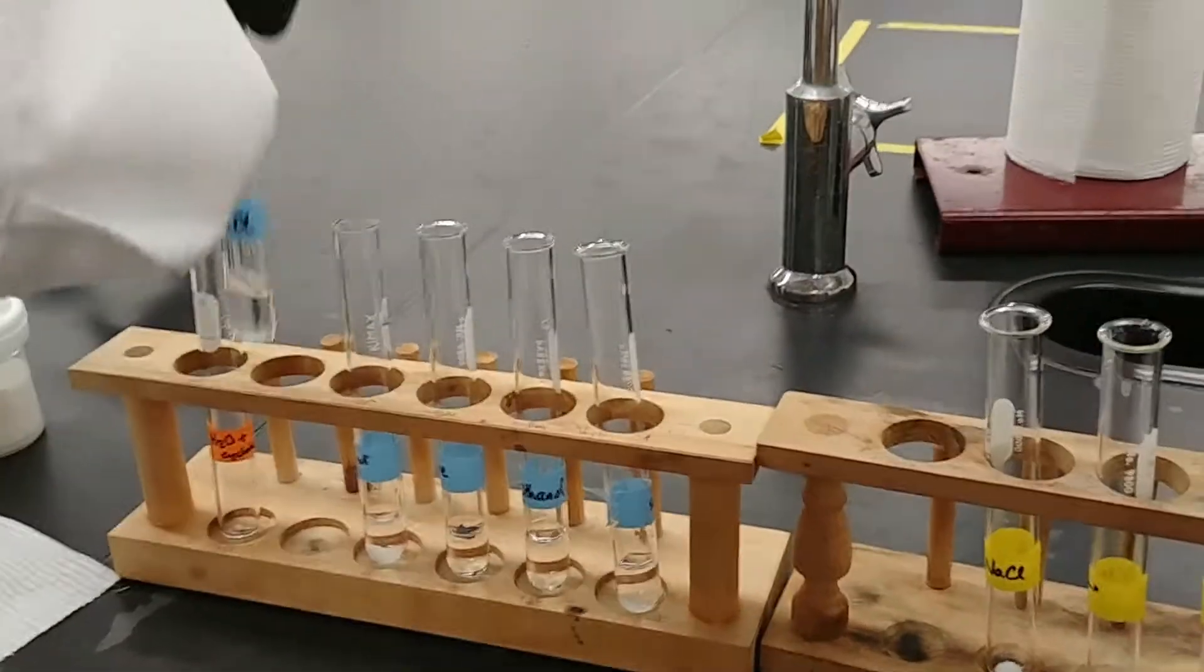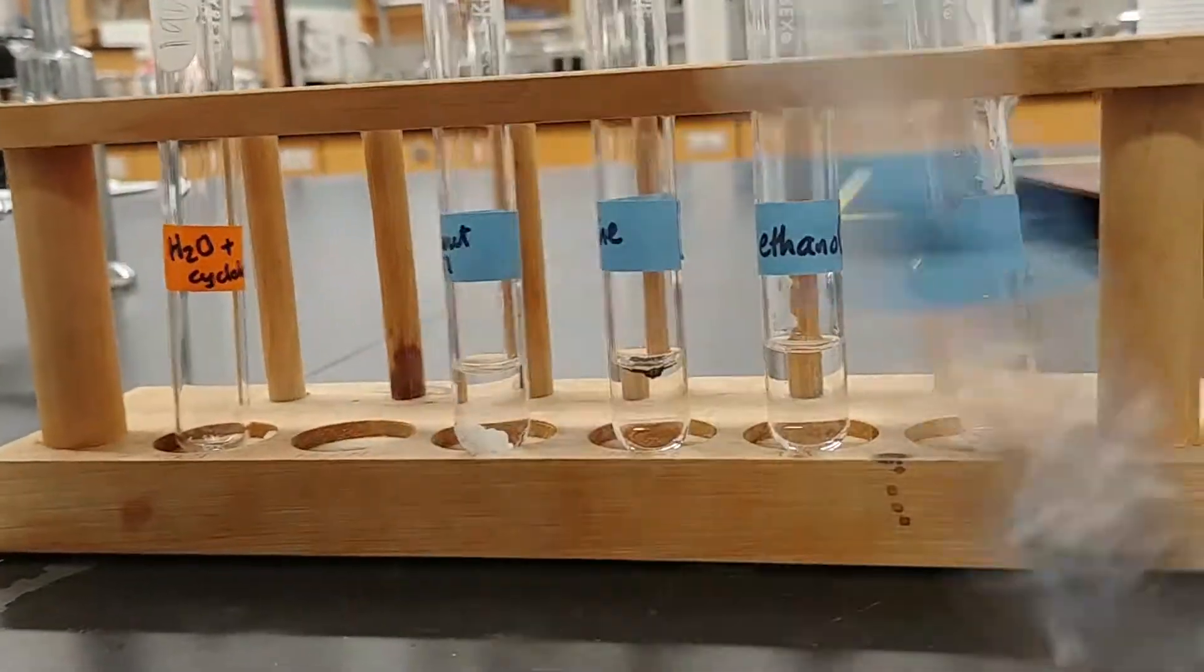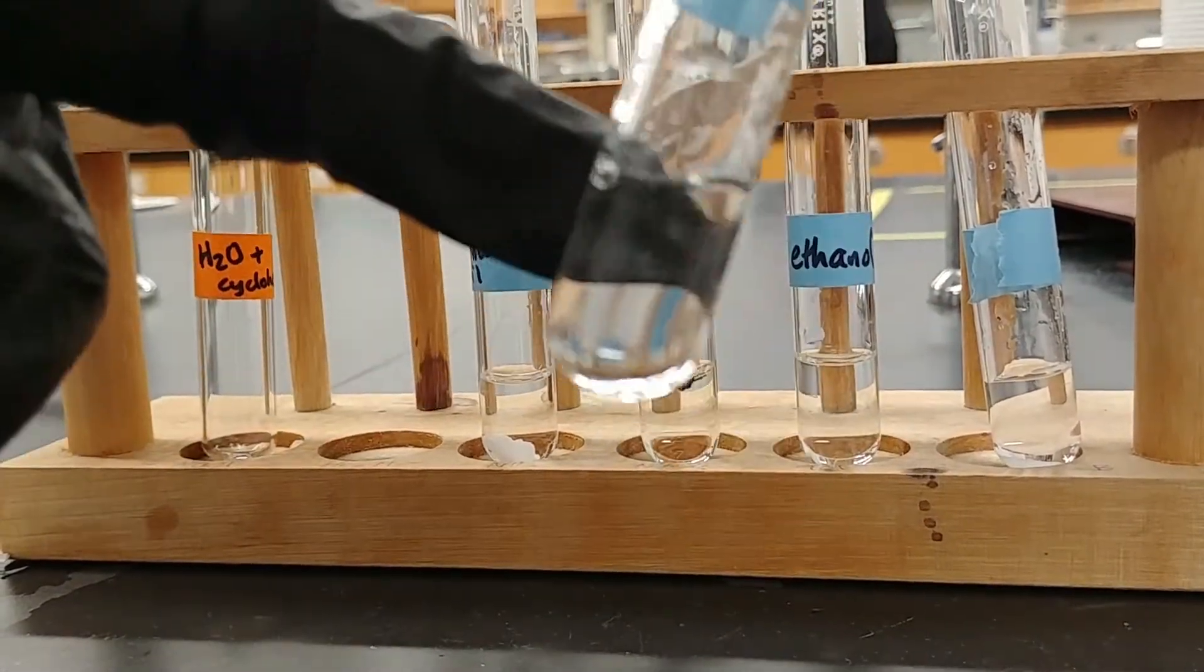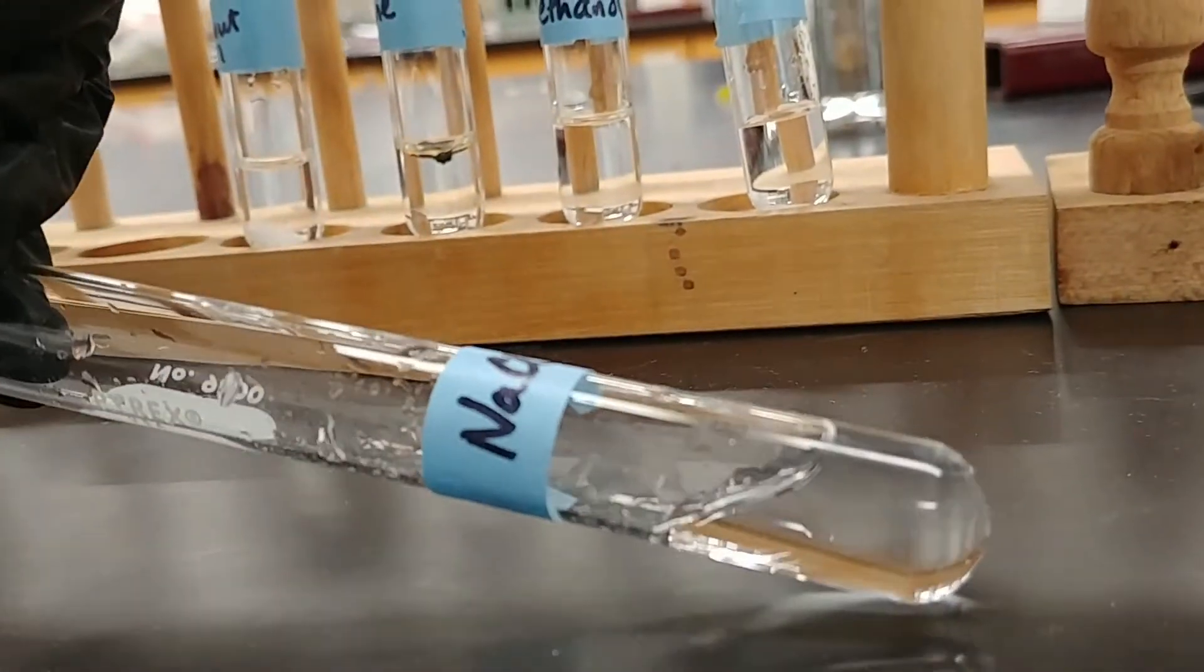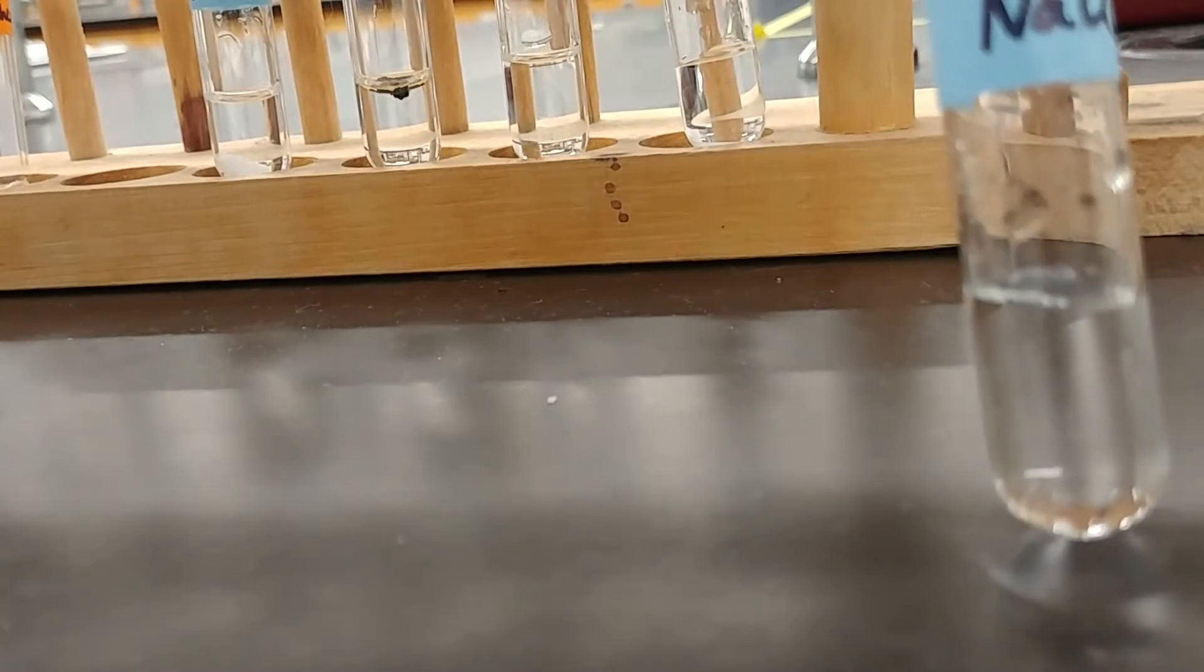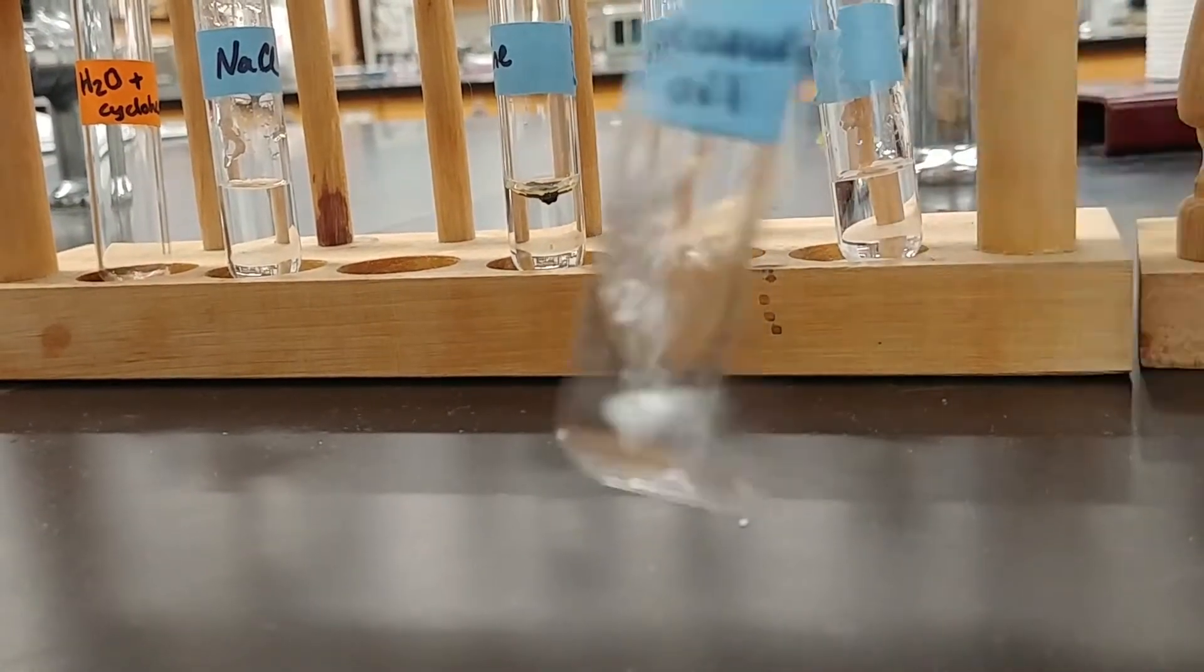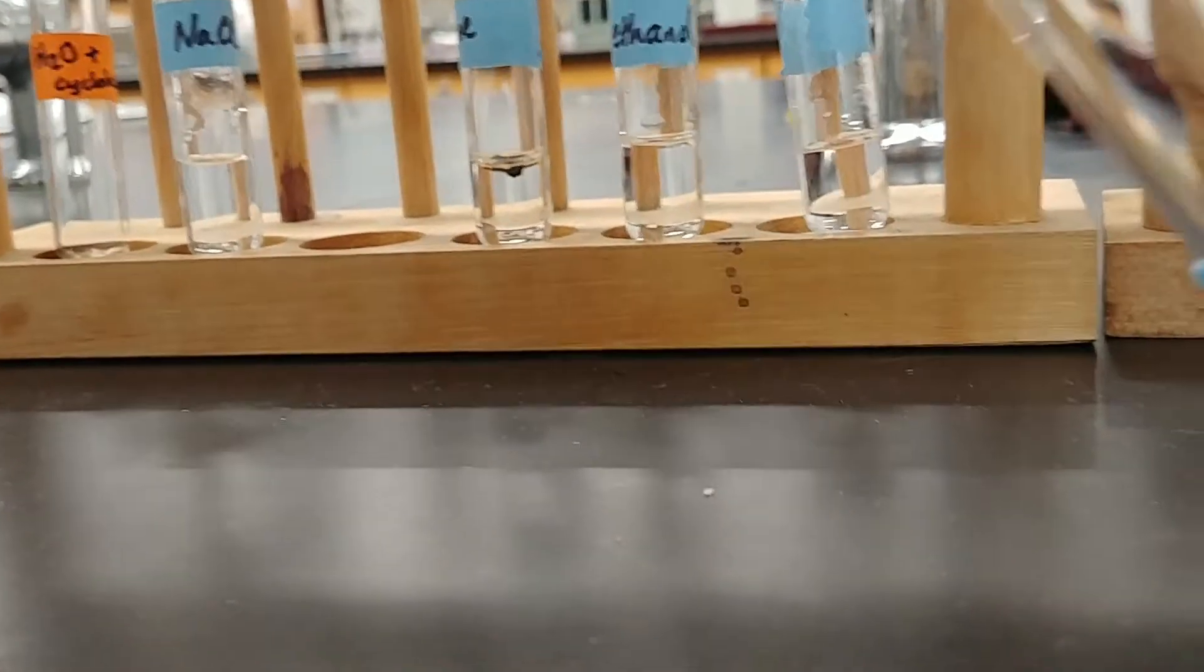So what I'm going to do is swirl these vigorously to get good mixing if they're able to mix, and then we're going to see what's left. This is our sodium chloride in water. Here we have coconut oil in water. Let's swirl that around pretty vigorously and see what we get.